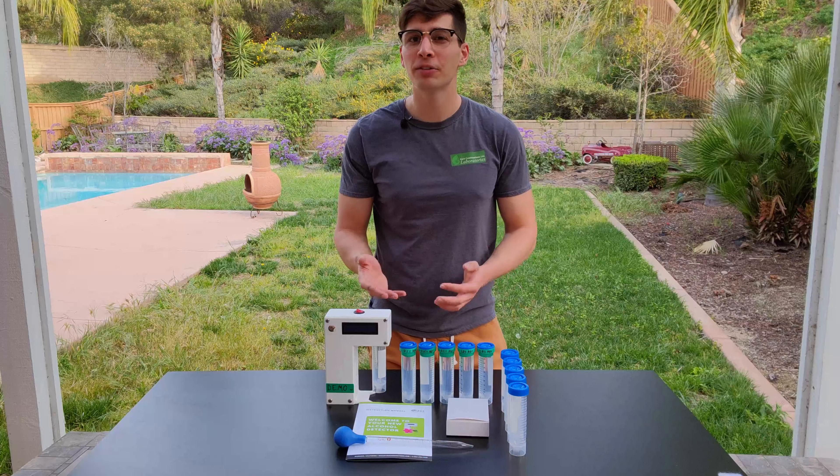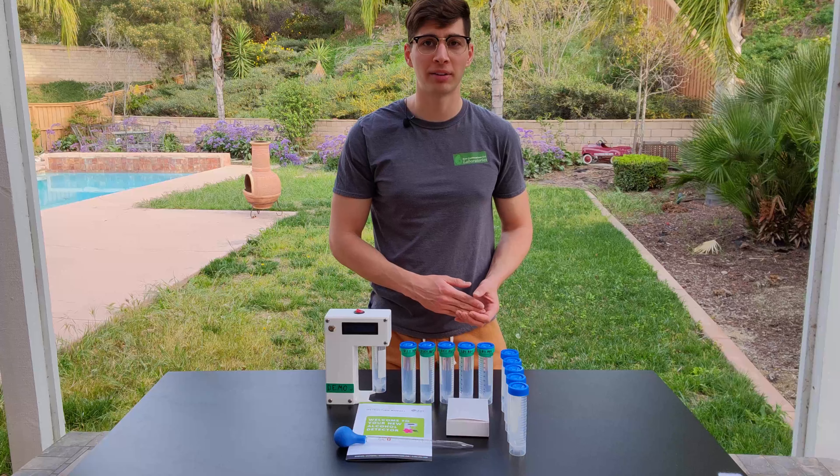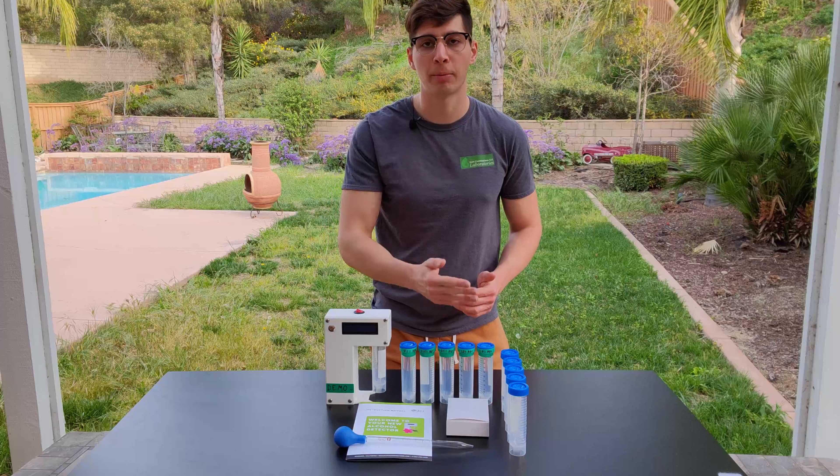All in all, it takes about 10 or 15 minutes to calibrate your device, but you only need to do this once or twice a month. After that, it only takes about one minute to measure each of your samples.